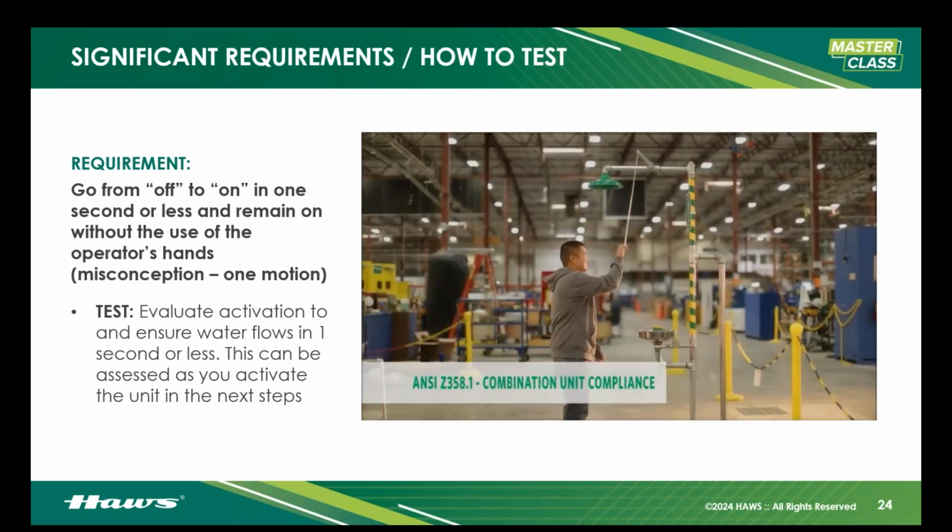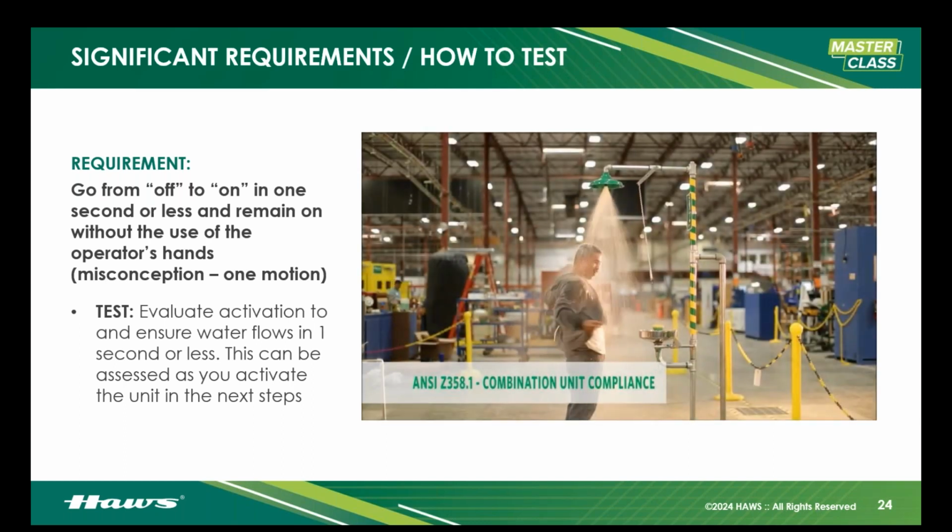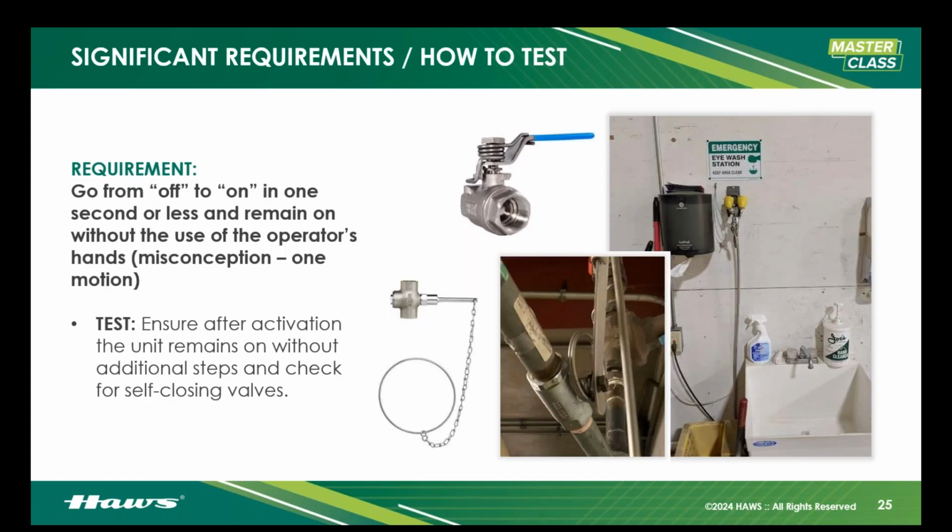It also has to be usable without the use of the operator's hands. If you have self-closing valves in place, those are a big issue. We have to get those uninstalled, and you need stay open valves in place. But there is a misconception out there too, that the standard itself says that you have to activate equipment in one motion. That is not the case. You can take multiple steps, but it all has to be done in under 1 second, and that is totally compliant. Now, just to give you some examples of that, those self-closing valves, just to watch out for these.